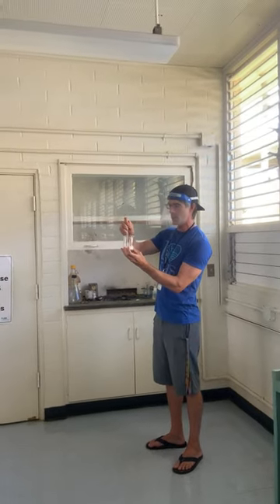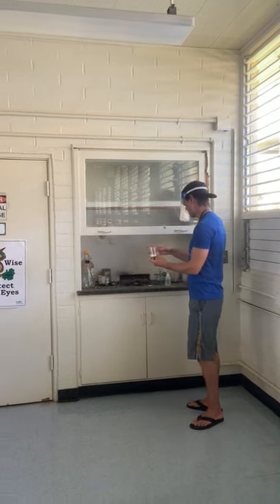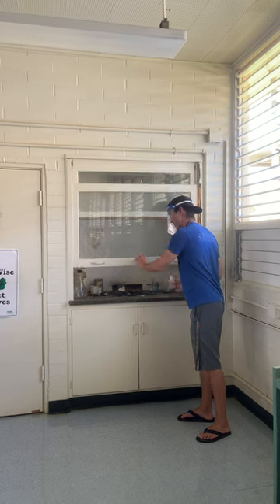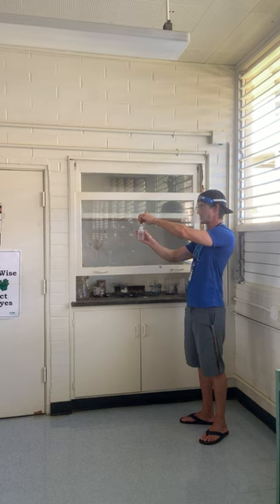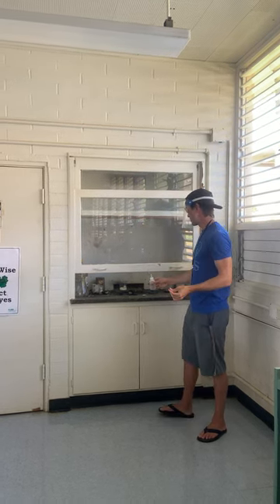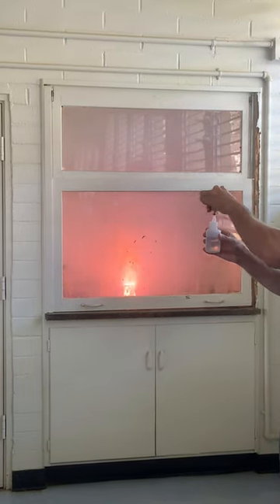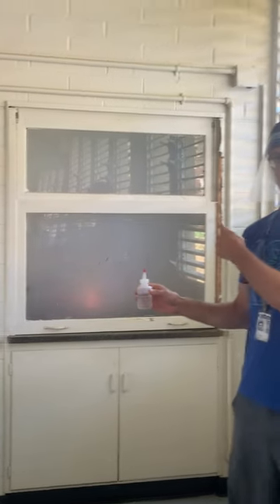If we left it, eventually it would react, but I don't really have time for eventually, so I'm going to set that kind of at the back of the fume hood, lower this a bit. I have concentrated sulfuric acid here, which is another oxidizer, and I'm just going to drop a little bit of that and stand back. We did it right — we'll break the beaker. There it went.